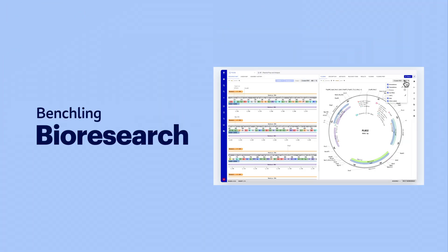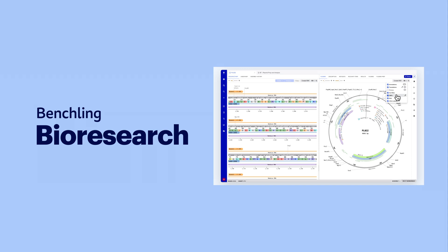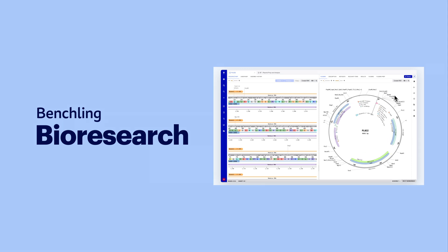Benchling BioResearch is a digital workspace that helps scientists design biomolecules, perform experiments, capture assay data, manage samples, and learn from results all in one place.